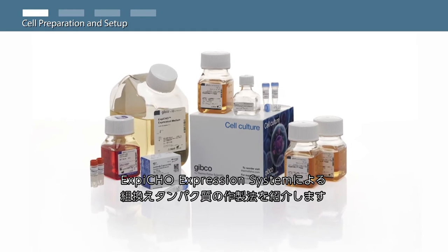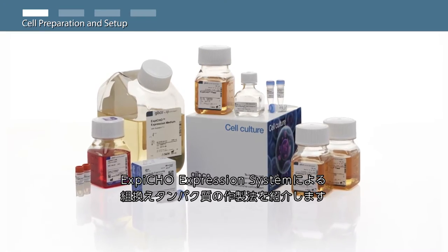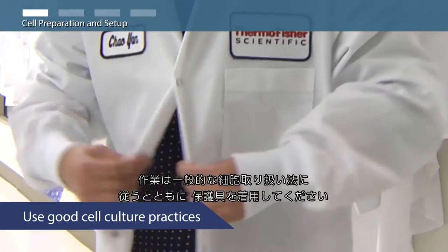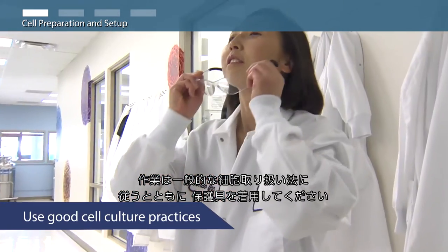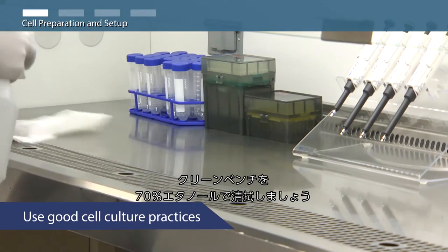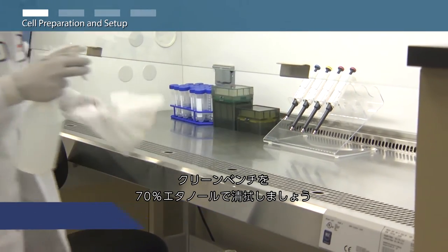In this video, you will learn how to produce recombinant proteins using the ExpiCHO expression system. As always, use good cell culture practices and wear your personal protective equipment. Be sure to clean your cell culture hood and work surface by spraying and wiping them down with 70% ethanol.